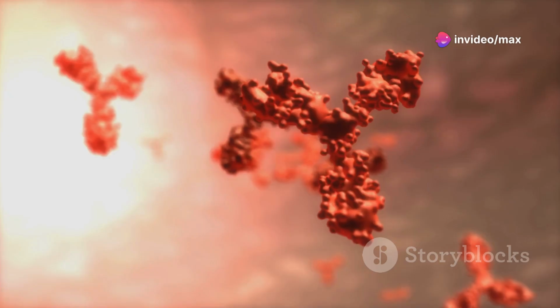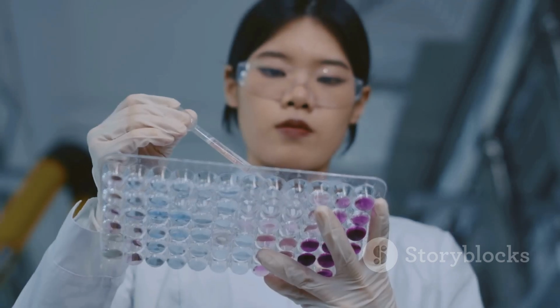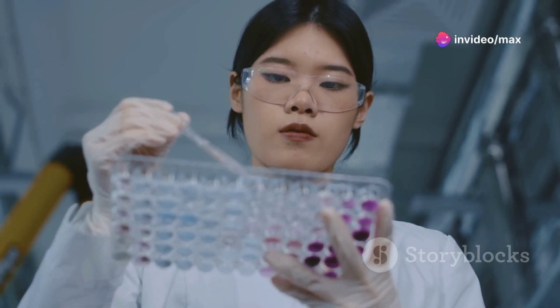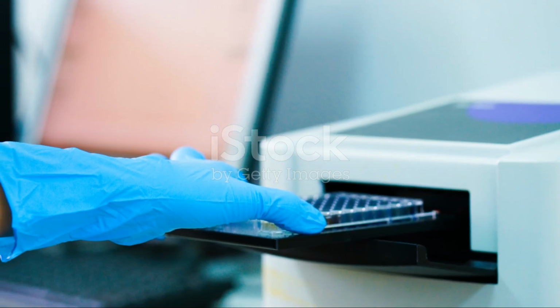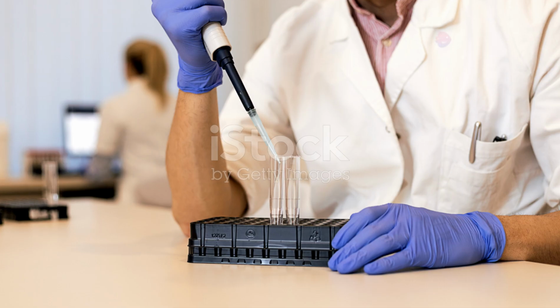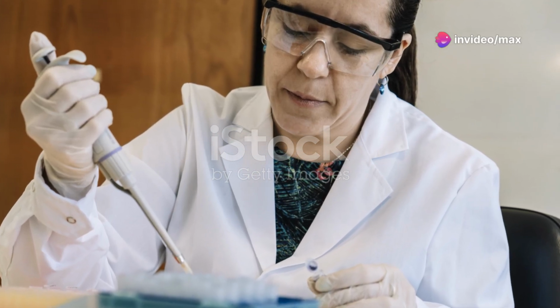Now the star of the show enters the stage, our sample. We add a measured amount of the sample to each well. If our target molecule is present, it will bind to the capture antibody. Time for a quick rinse. We wash the wells to remove any unbound molecules, leaving behind only those specifically bound to our capture antibody. Enter the detection antibody linked to our enzyme. This antibody will bind to a different part of the target molecule, forming a sandwich-like structure. Another wash ensures that only the specifically bound detection antibodies remain, minimizing background noise.